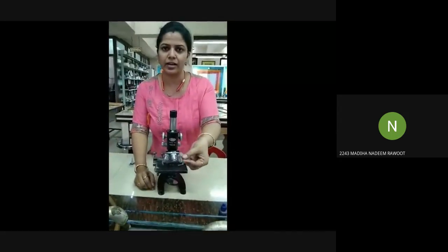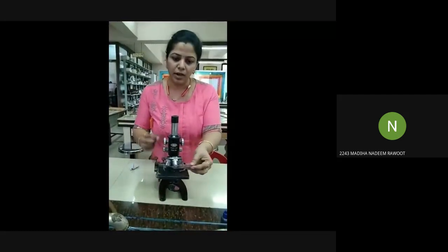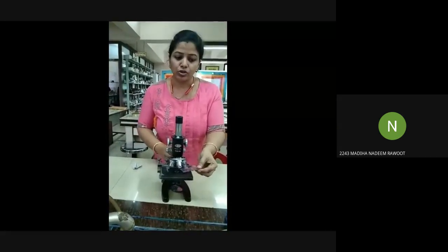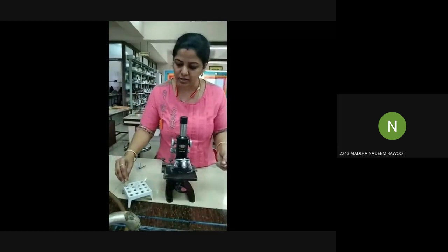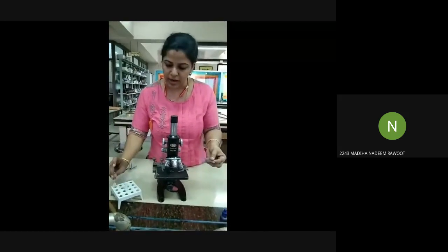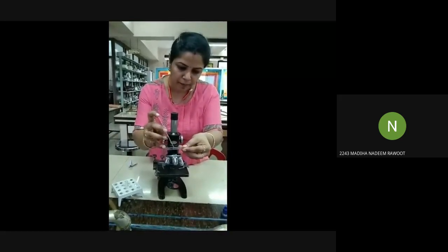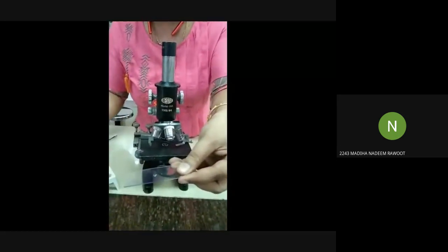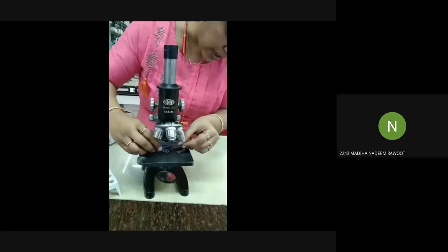Okay, now that the slide has air dried. Air drying is very important, because here we are not going to put any cover slip. We are supposed to see it under the compound microscope under 100x. For 100x, we have to use this cedar wood oil. This is cedar wood oil, and just a drop of it. Using this capillary, I will place just a drop of it at the center of my smear. Okay, not much, just enough, and then you have to place it on the stage.